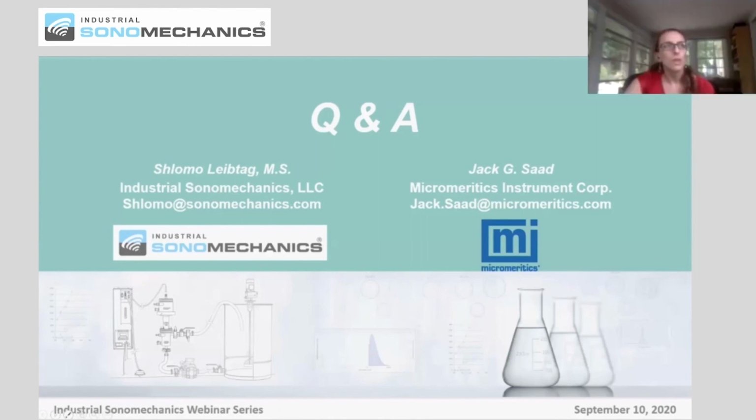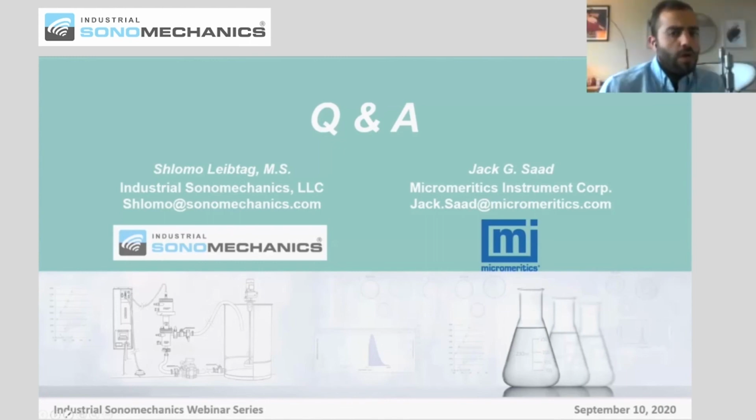Thank you, Jack. The next question is for Shlomo. How does a finished nano-emulsion not dispersed in water stand up to heat? Not dispersed in water? Yes. Well, that will ultimately depend on what the continuous phase is.